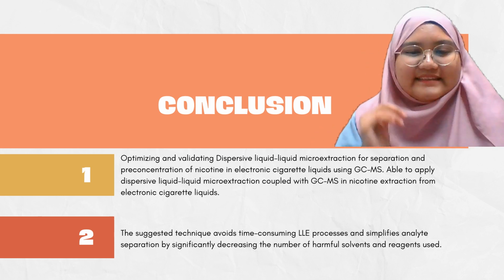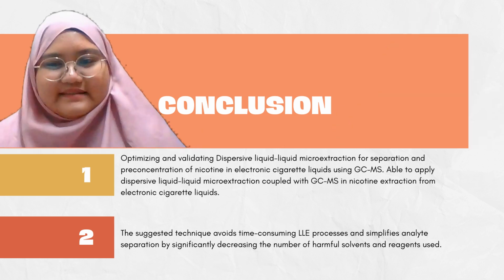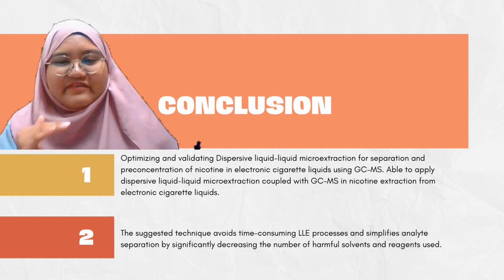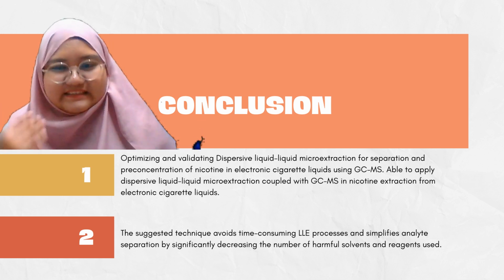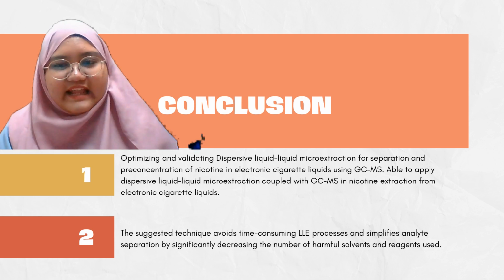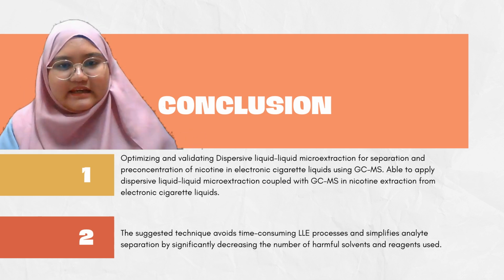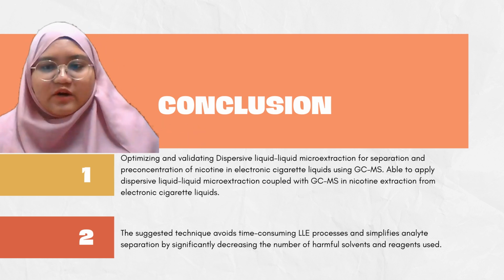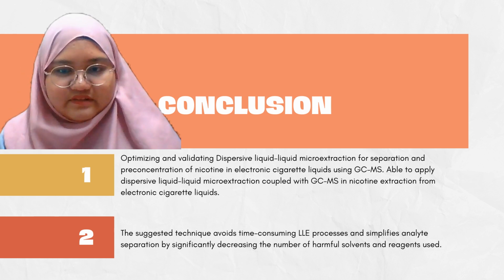The suggested method avoids the time-consuming LLE process because it simplifies analyte separation by significantly decreasing the number of harmful solvents and reagents used. Therefore, DLME has been shown to be an environmentally friendly option for future analytical labs to consider when assessing nicotine from e-liquid samples in pre-concentration and determination.